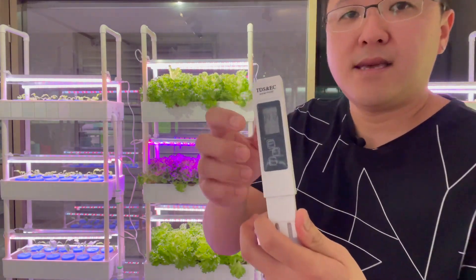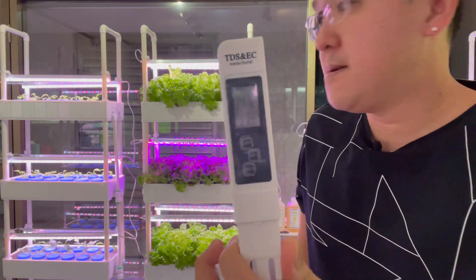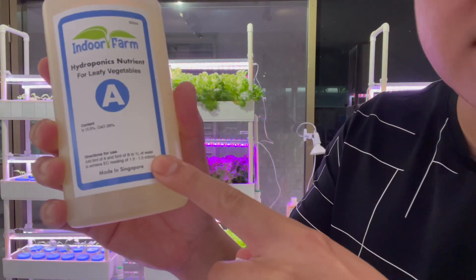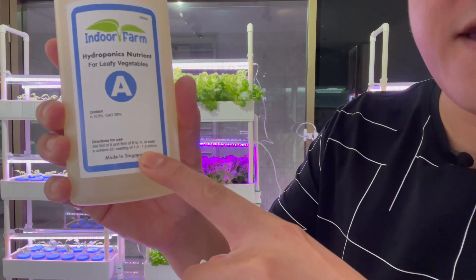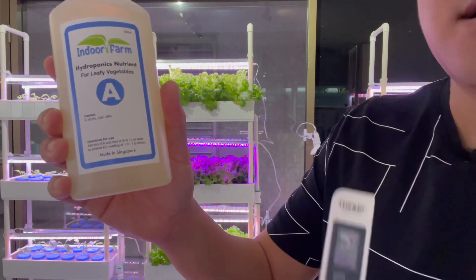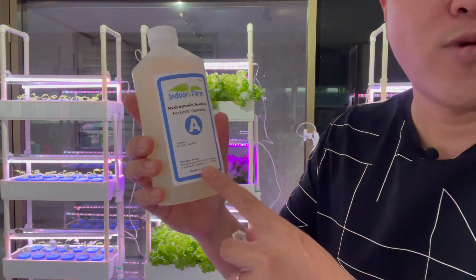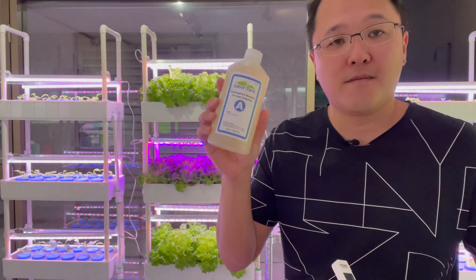One last thing: as you can see, the meter is in µS/cm — micro siemens per centimeter. And looking at our nutrient label, it says mS/cm — milli siemens per centimeter. So when you see 1.0 to 1.5 mS/cm, it also means 1,000 to 1,500 µS/cm on your meter. The conversion from mS to µS is 1,000 times, so you can easily convert between the two units.